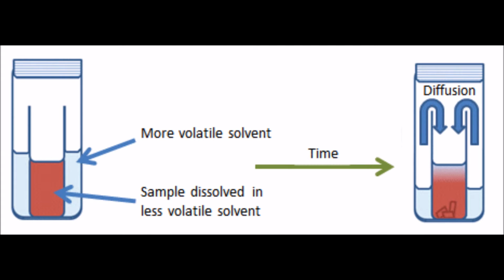Okay. For vapor diffusion to work properly, you need a binary solvent system. In order to create a binary solvent system, you need to choose 2 liquids that mix together well. Your compound that you're trying to make the crystals with should be soluble relatively well in the liquid with the higher boiling point. We will now call this liquid the solvent. The compound should also be insoluble in the liquid with the lower boiling point, which will be called the precipitant from here on out.